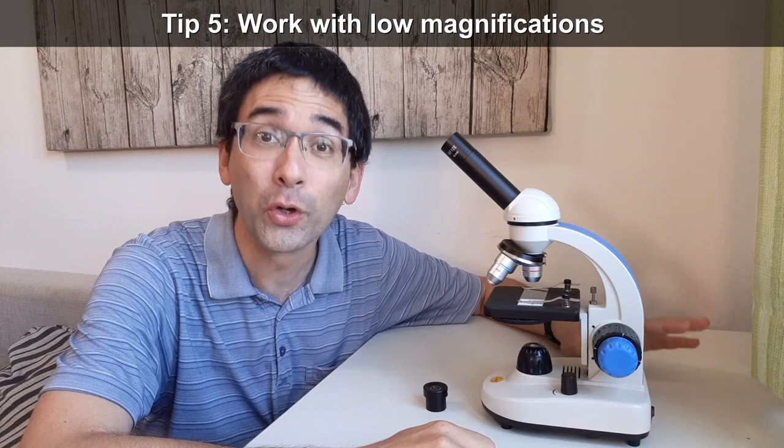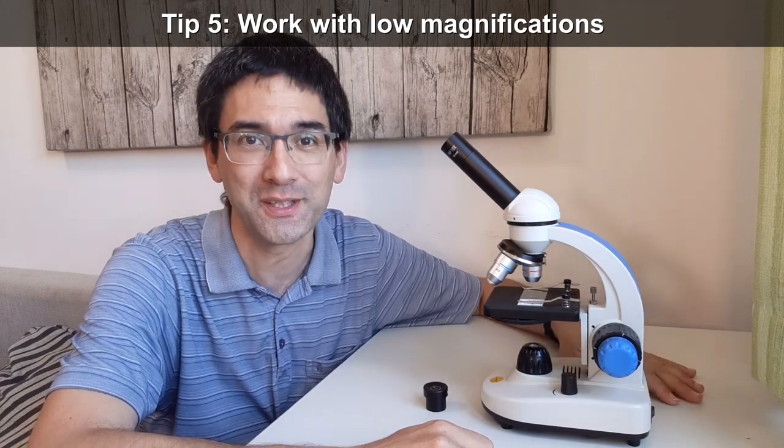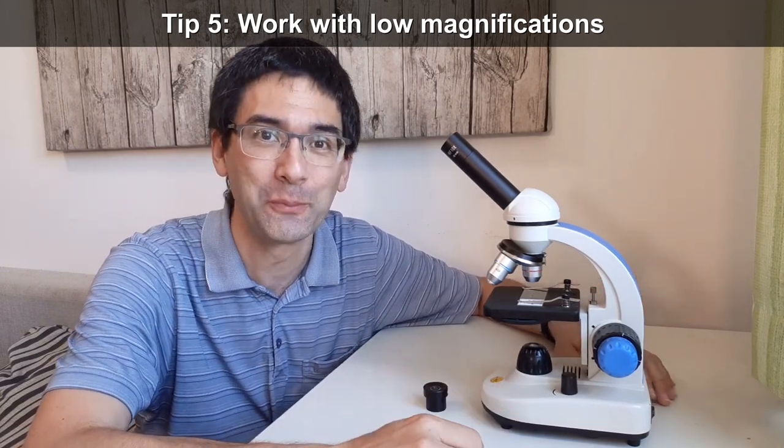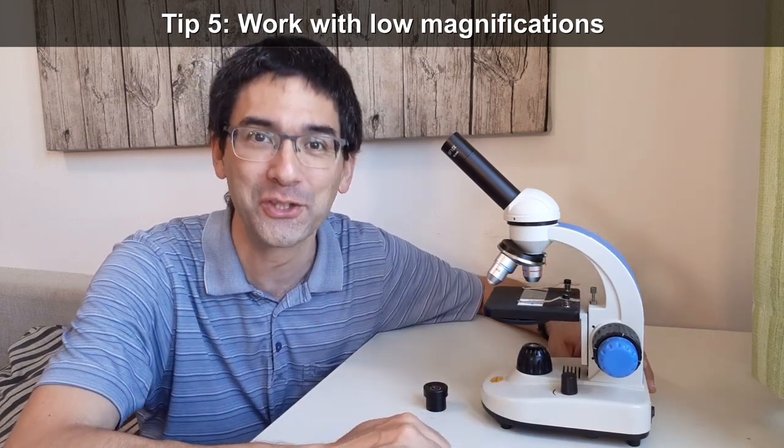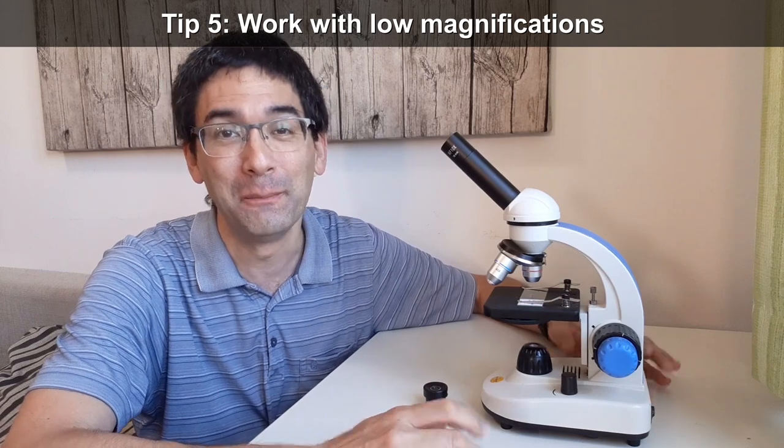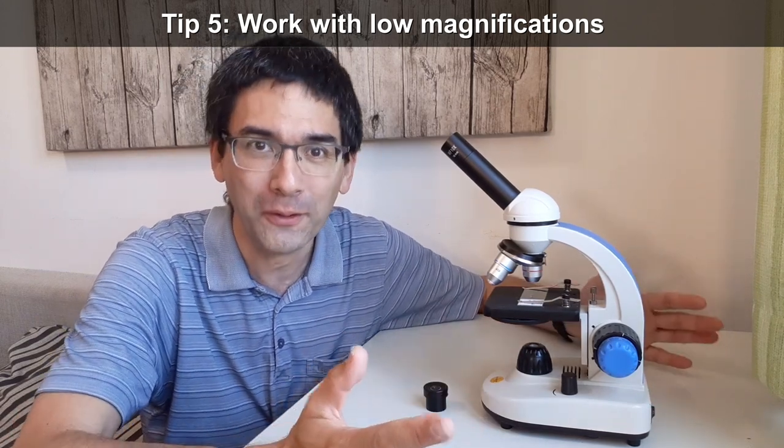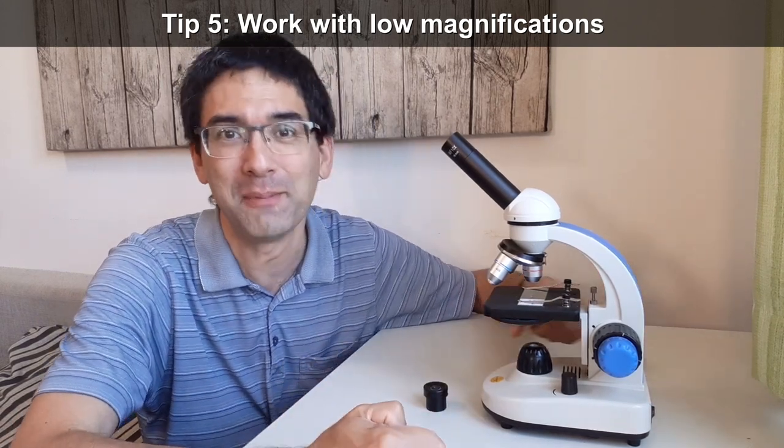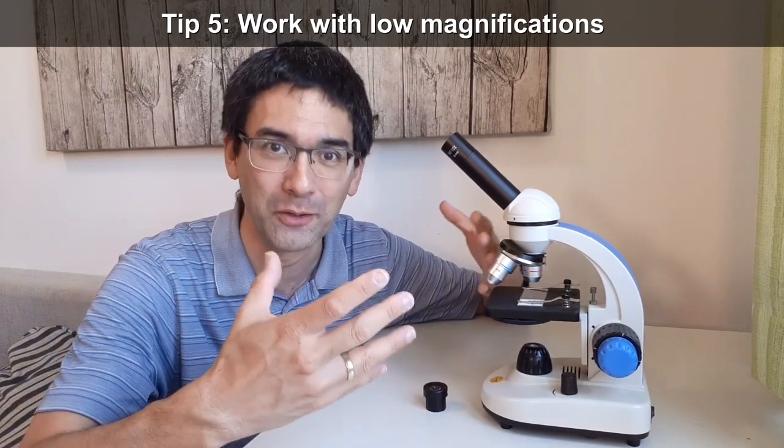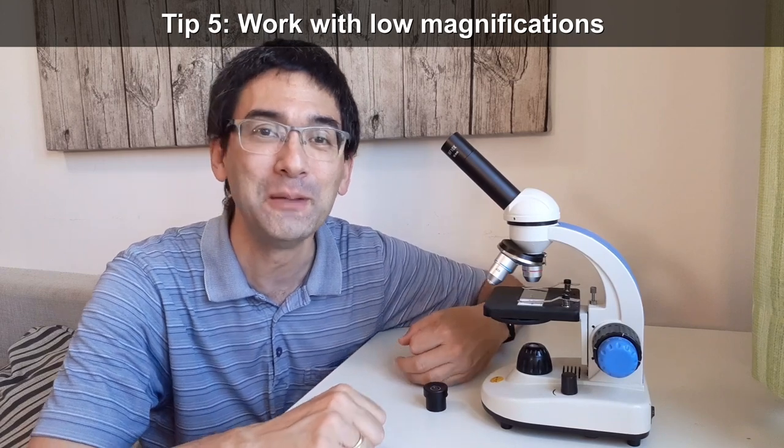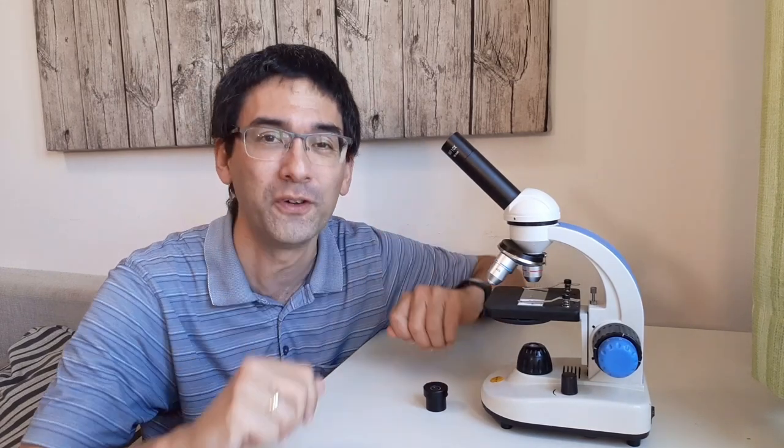Next tip is work with low magnifications. Many beginning microscopists, what they want to do is they want to switch immediately to the highest possible magnification because they think that they see more the more that you magnify. But as a matter of fact, the image becomes just darker and more blurry. Sure, it does become bigger what you see, but often you don't see many more details because everything's just more fuzzy and blurry.